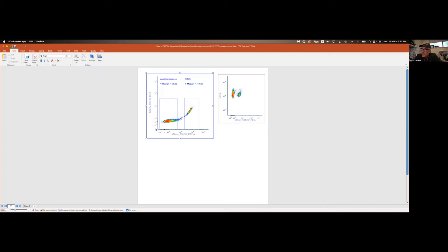I want to point out that I am using a bi-exponential display. That basically pulls the data away from the axis and gives me a better view of what's going to happen. I'm going to end up with negative fluorescent values as I subtract the percentage of my signal. If I was to use a log scale, all these negative values would be stuck against the axis and would be very hard to visualize.